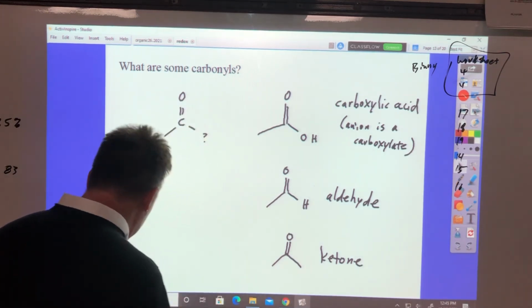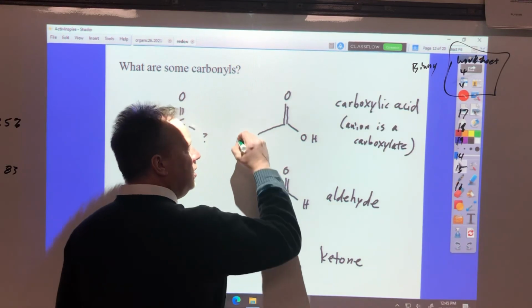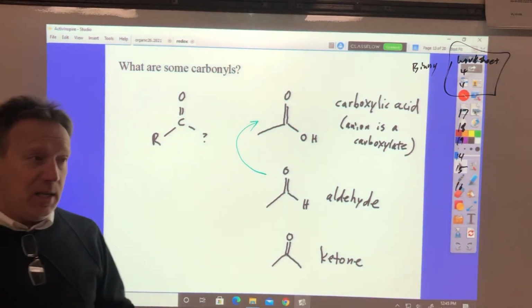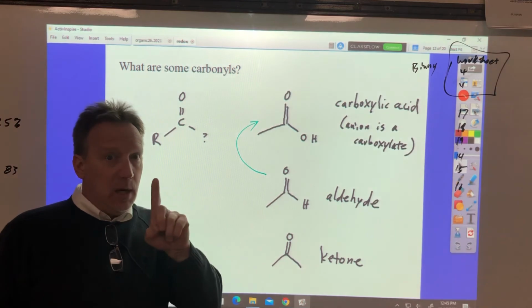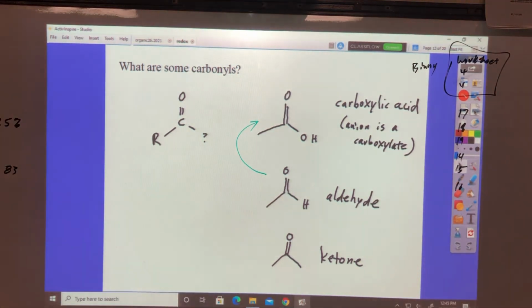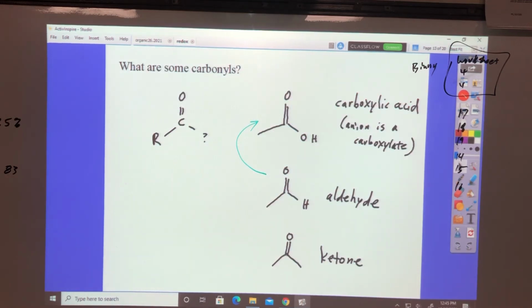And in this lab, the Tollens reagent will convert aldehyde into carboxylic acid in a series of multiple steps, and then it'll be destroyed in the process, most of it. We've got to get the leftover, remind me, to neutralize it. Yeah, I think we'll cut this video off here and put the rest of it on another one.